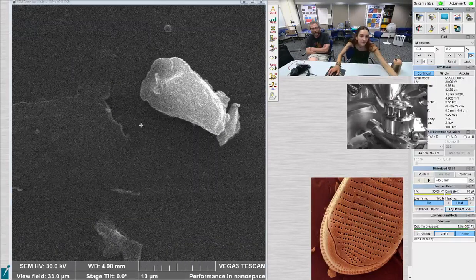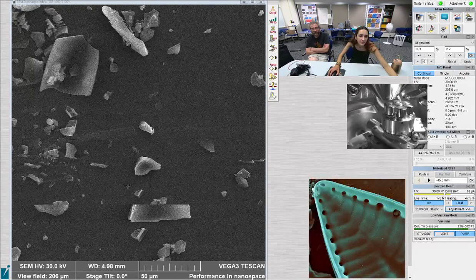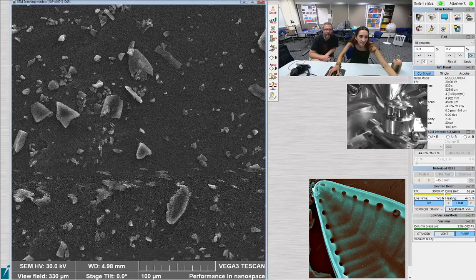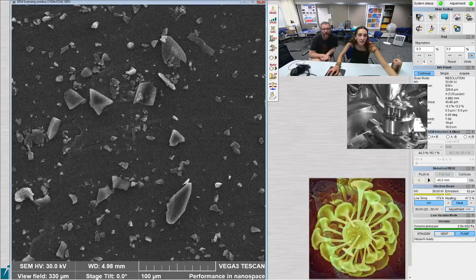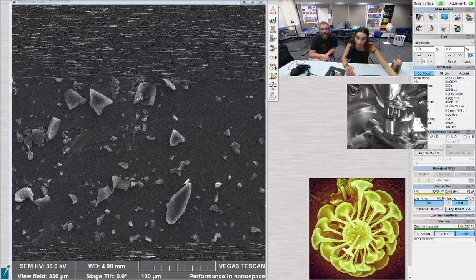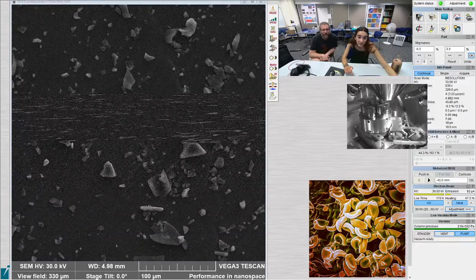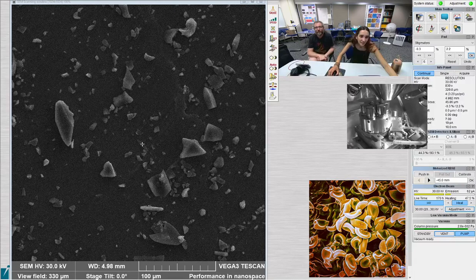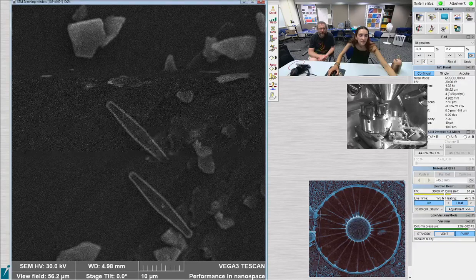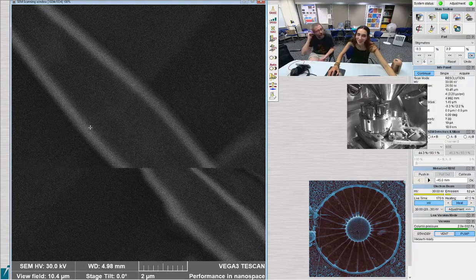Where is it? Where did it go? I don't know. Oh, there it is. Now it's basically vertical, so you need to go the other way. Try 245. That's a lot of turning it did. Oh, that's good. Better. I don't know, it's perfect, I think. Good guessing on my part. Except for now you need to focus it again, unfortunately.